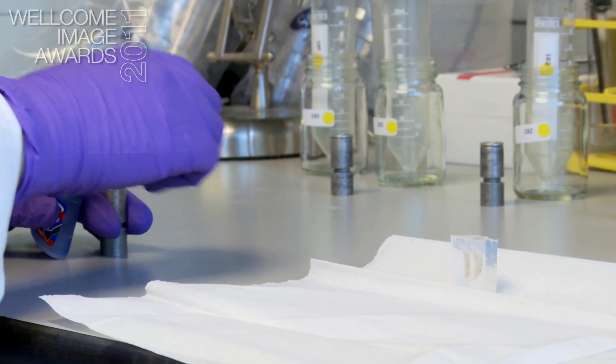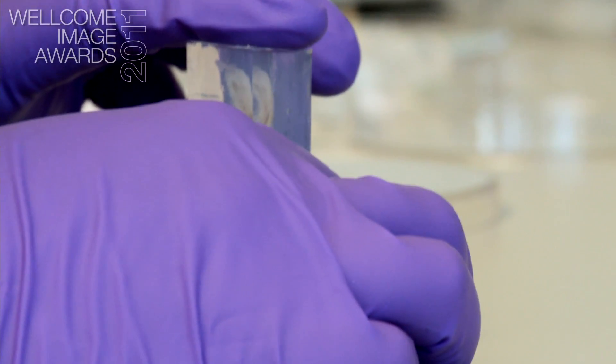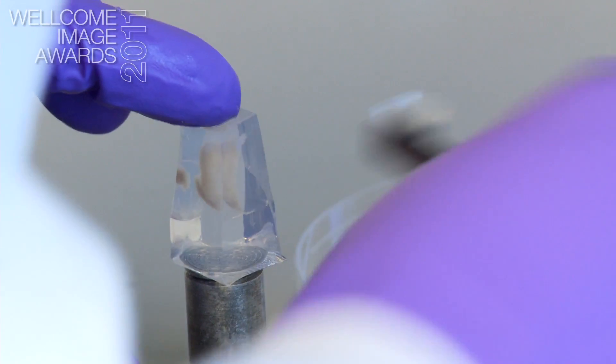Once the agarose has set, we can then take this little block and glue one end of the block onto a metal mount. We then cut it into a block and we then have to do this clearing process.